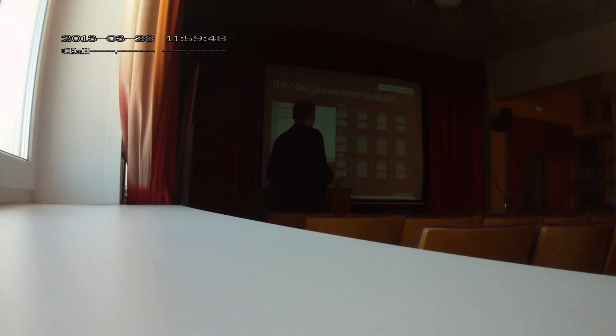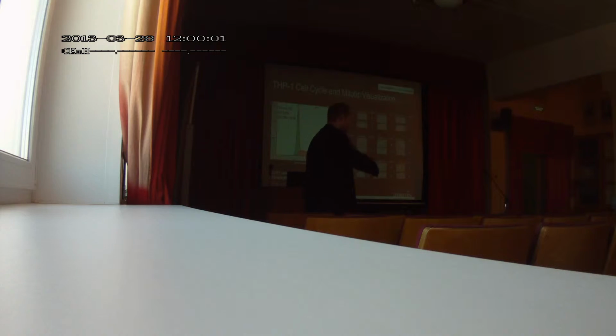helper. My second part of the application would be something which a flow cytometry does on a daily basis. I'll show you how the ImageStream can do not only the similar or equal data, but we can get a couple more pieces of information on top of that.